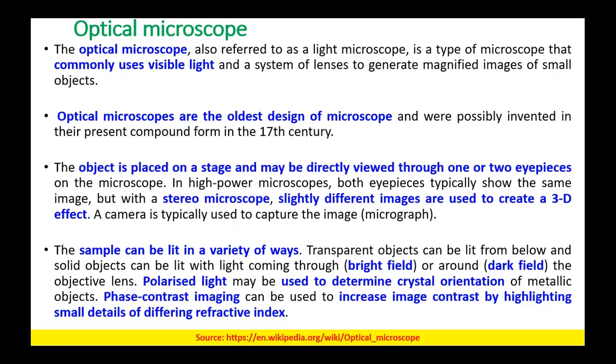Now coming to the optical microscope. As I told you, it uses visible light, hence it is also regarded as a light microscope. It commonly uses visible light, and it uses a system of lenses to generate magnified images of small objects.